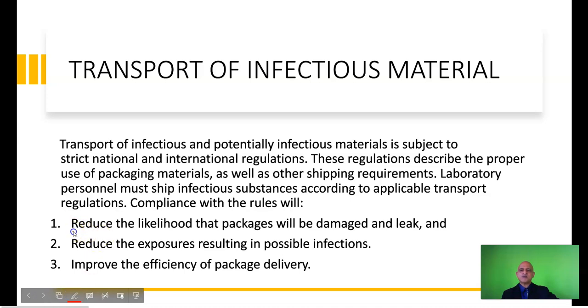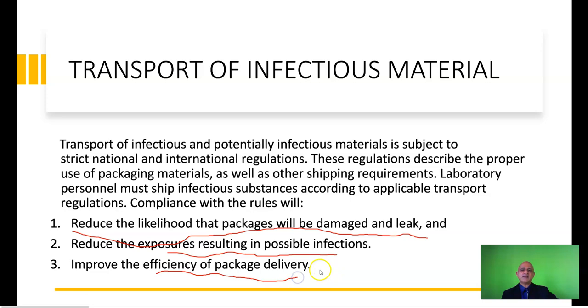So transport protocols reduce the likelihood of that package being damaged or leaking, reduce exposures which can result in possible infection, as your package may travel through the national network of transports, including the airline system, and they improve efficiency of package delivery. This is why proper labeling is very important.